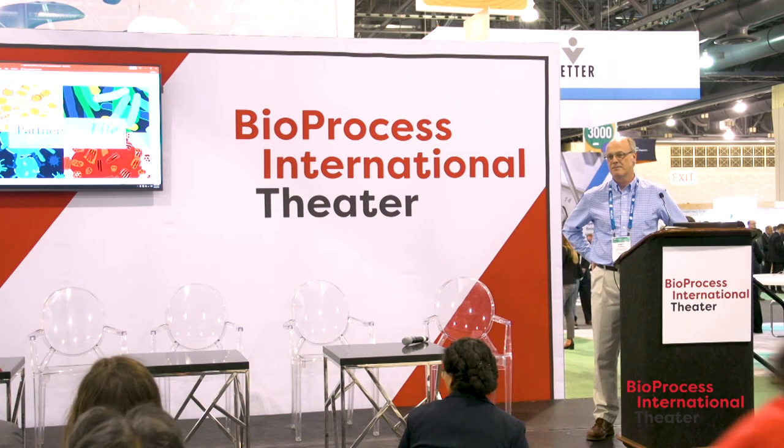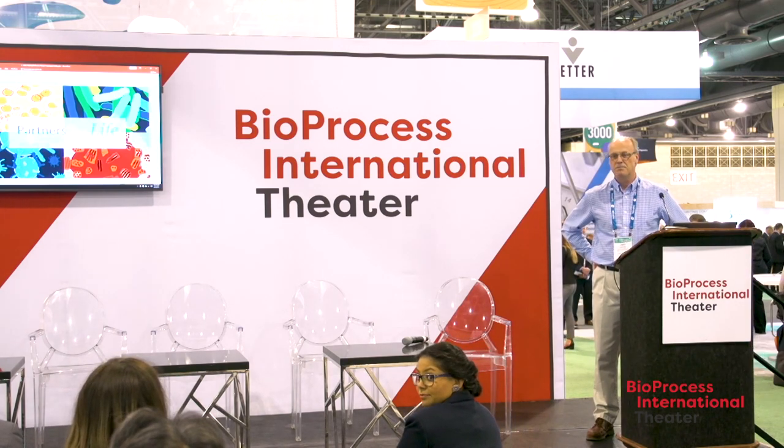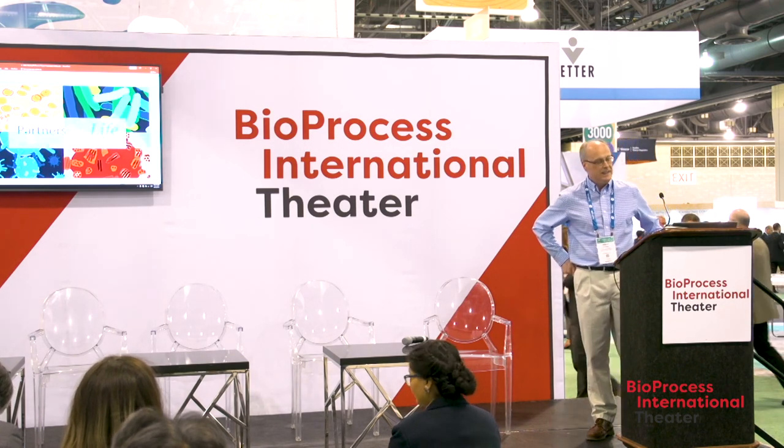Thanks, great talk. I was wondering how these methods might change if you were, let's say, measuring LVV versus AAV versus oncolytic viruses. Are there differences in terms of how HPLC or, you know, dynamic light scattering might be used?